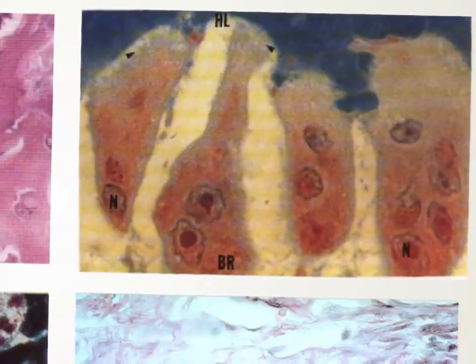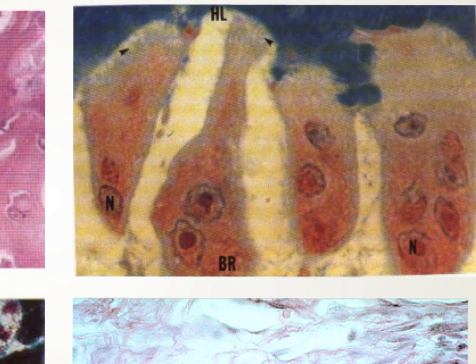Now, what do we have in this picture? These are the osteoclasts. The osteoclasts are multinucleated; these are the nuclei present in the osteoclast. We have here 4 osteoclasts. Then we have this area which is called the brush border, like a brush, and it is towards the surface of the bone. This is the bone.